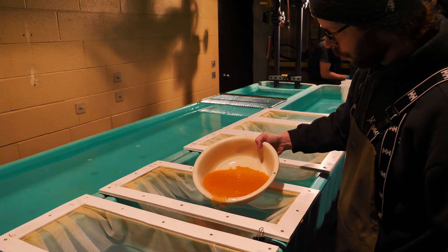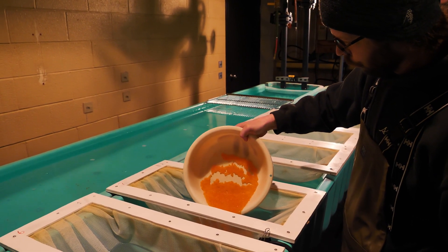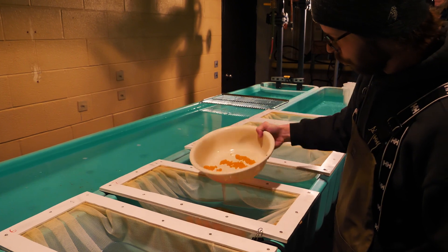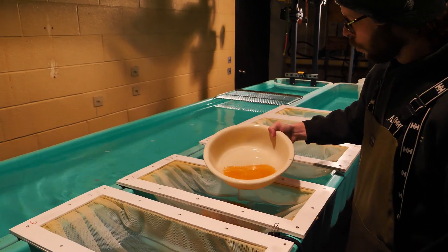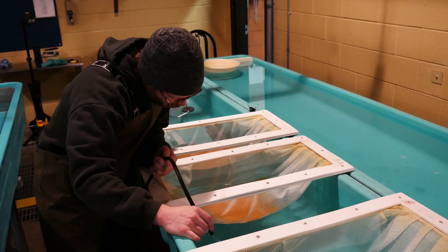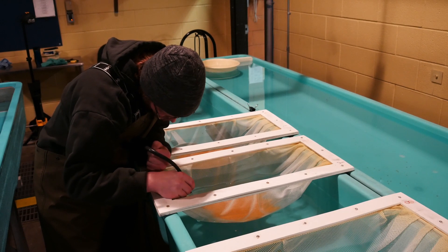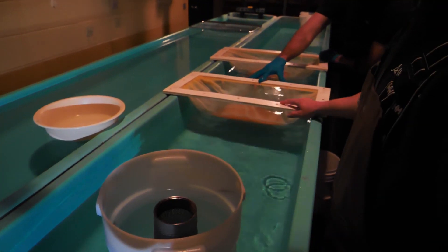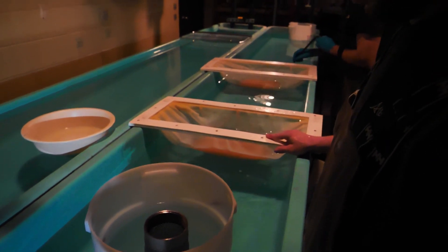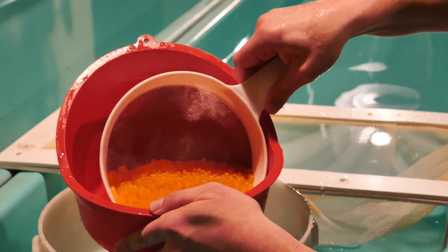The eggs are transferred to a net container and held in 10 degrees Celsius water, where egg development occurs based on the accumulated temperature minutes for the trout species being processed. Once the required accumulated temperature minutes are reached, the eggs are transferred into the cylinder and placed into the pressure shocker.